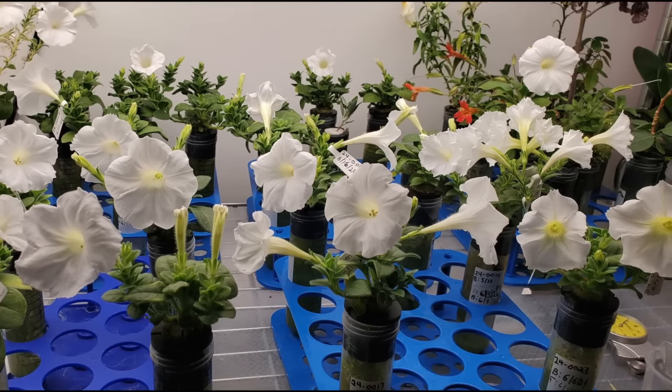In terms of the methods that you're using to change these flowers, is it mainly the agro-infiltration of the Agrobacterium, or is it... I guess I also have another question. Sorry, I ask multiple questions at once all the time, and it's a problem. But there's that piece, and then I'm kind of confused how the gene gun fits into the genetic modification, like if it gets used in tandem with the Agrobacterium or if it's an entirely separate process.